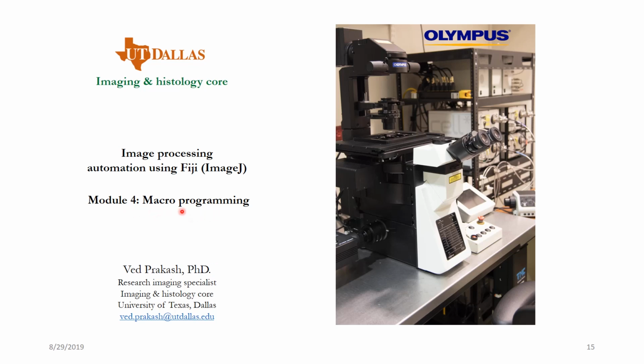By looking at these two words, usually people get scared, including me, because the words macro and programming sound a little scary to biology and chemistry professionals most often, and of course, people who have never done any kind of programming in their life. But I will assure you that it is a very simple and straightforward process. It just requires a few mouse clicks, doesn't require a big deep knowledge about Java programming or any other thing like that. So you can sit at ease and just observe what I am doing.